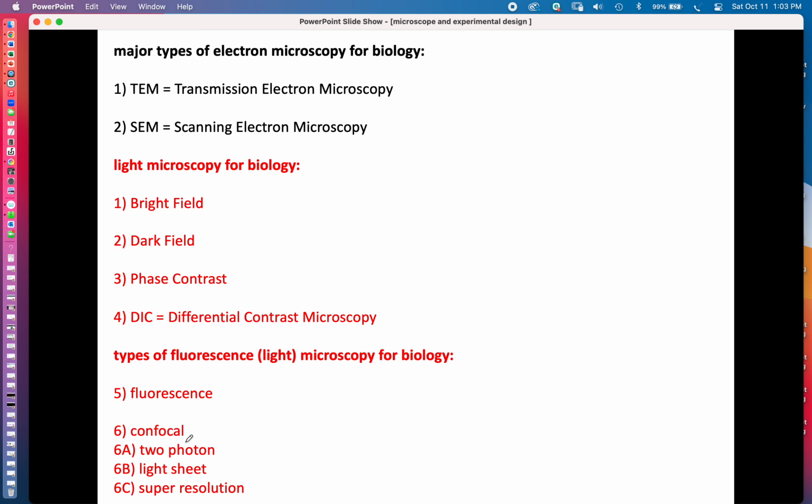These are all examples of light microscopy, and so they're all used on a microscope that's similar to the microscopes we used in our course, but there are additional features. This first group of these have just a regular light microscope like we used, but they have some ways of filtering or altering the light path to create different visual effects. But again, it's a light microscope. Then these are all an example of a kind of microscopy called fluorescence microscopy. It's still a type of light microscope.